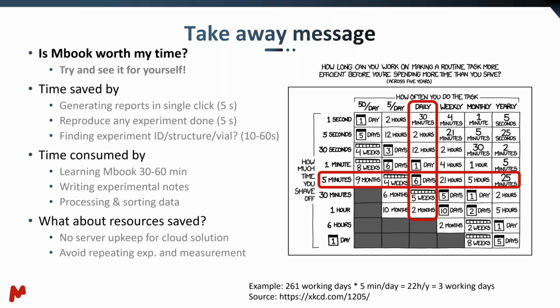Another way to think about whether it's worth your time and resources is about the resources. When running on a cloud solution, you have no upkeep of the server, no backups you have to take care of, and no updates you have to do.